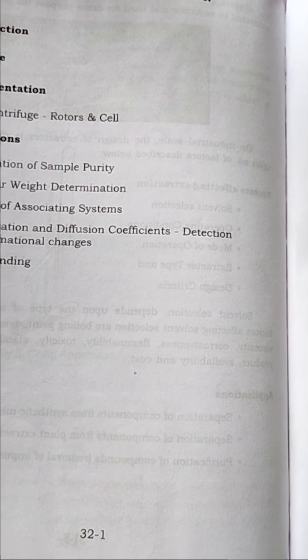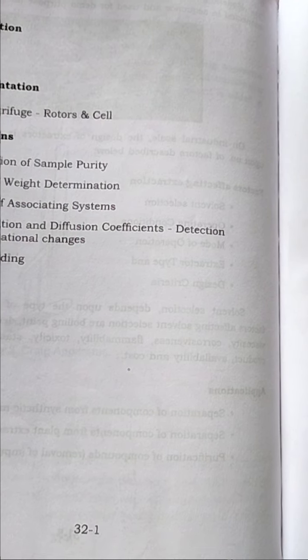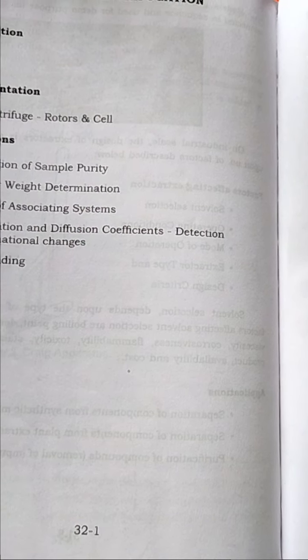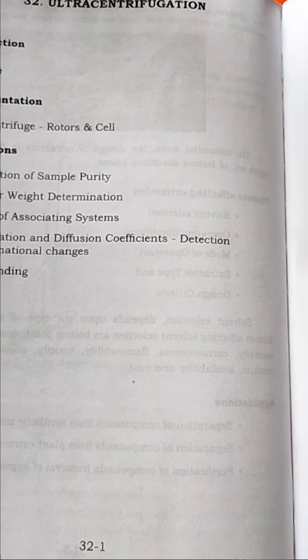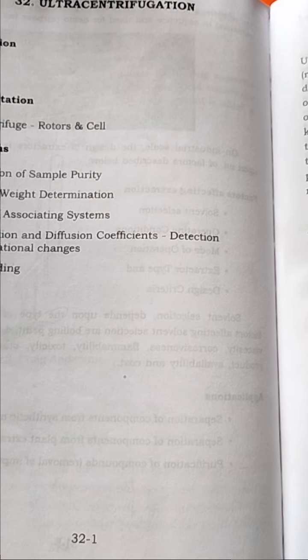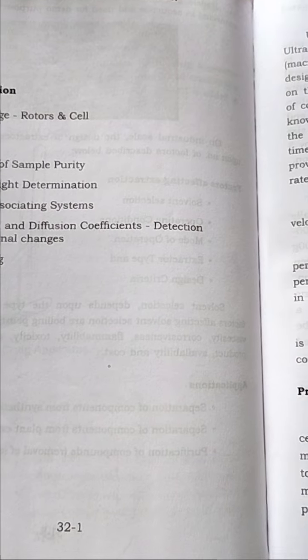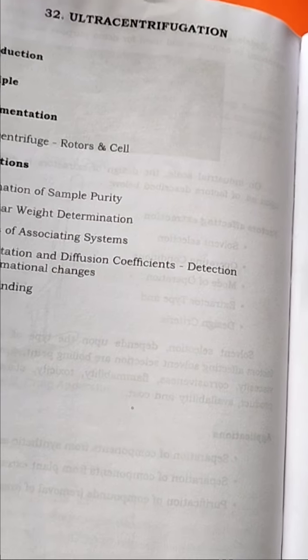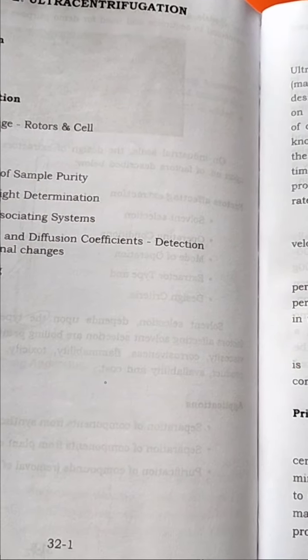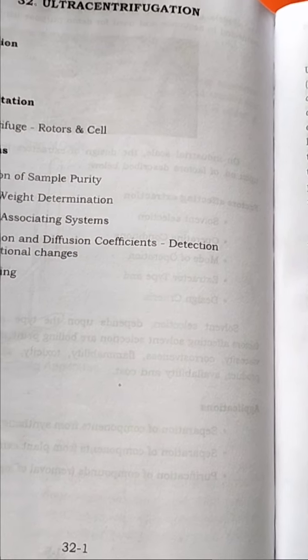Here the monomer is a small molecular weight compound, and dimer means double monomer, which has double the molecular weight of the compound, since it is two compounds. Likewise, equilibrium analysis can also be performed to provide dynamic equilibrium information, that is, the association or dissociation rate of the multimeric state.